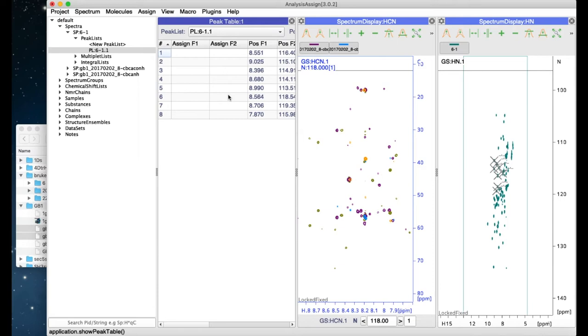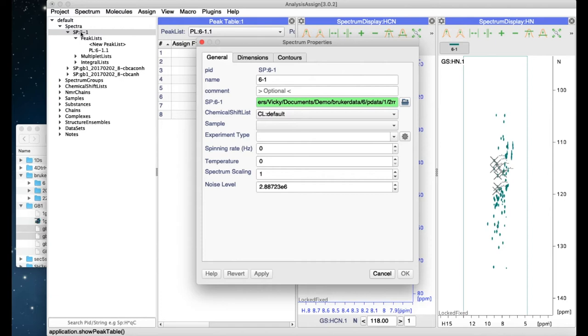You can double-click on an item in the sidebar and that will bring up a properties box which will allow you to make edits. In the case of a spectrum, for instance, you can change the spectrum name, add an experiment type, and various other parameters.